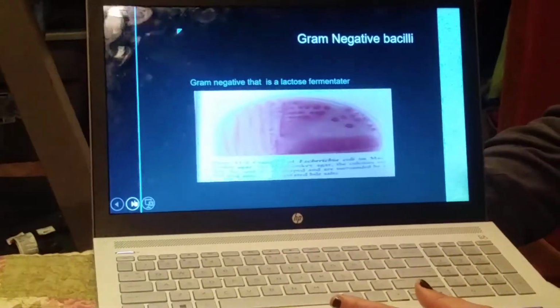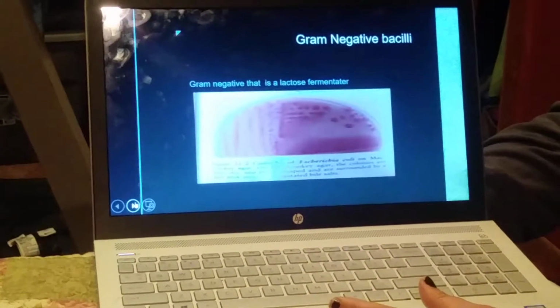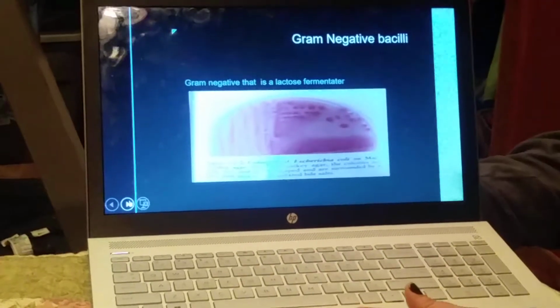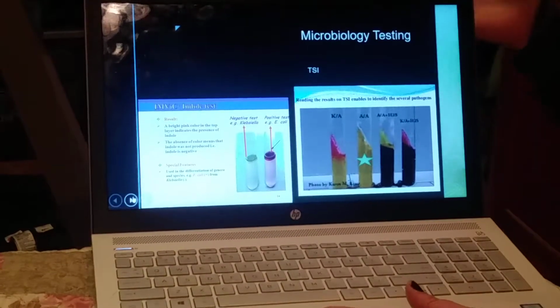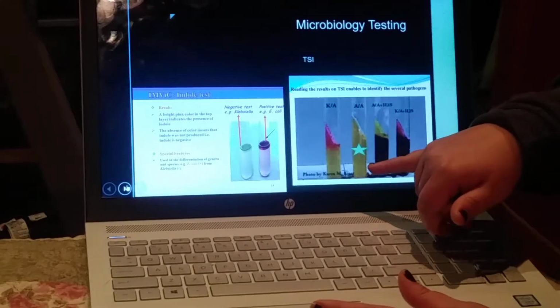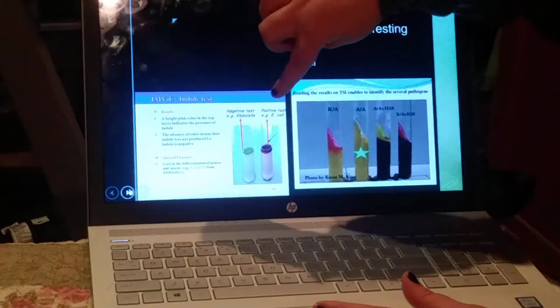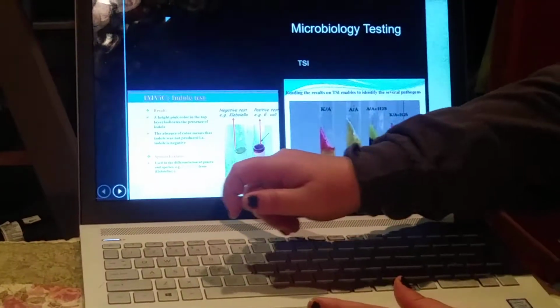So the next organism that we're going to talk about would be the gram-negative, the second organism that showed up as a non-hemolytic. And as you can see here, it ferments, and it has showed up as nice pretty pink and rough colonies. And then here are the few tests that you would do. The TSI would be an A over an A, and I starred that right there to show it can be completely yellow. And then on the indole test, a positive, which it was, would have the purple on the very top, and a negative would point to Klebsiella.